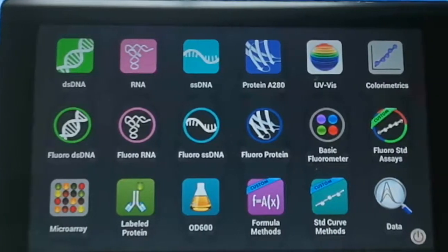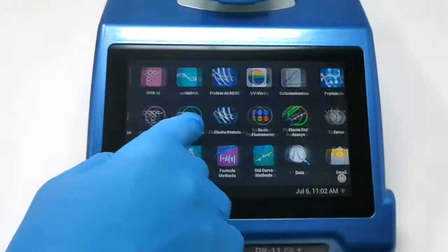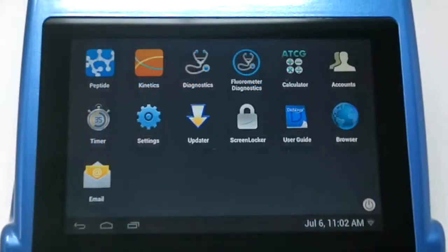And then we can swipe through to the second page, and here we have some additional measurement apps such as peptides and kinetics, but also some of the housekeeping functions for the DS-11 series. So things like diagnostics to check correct working of the instrument. We have that for UV vis and for fluorescence. And also here we set up things like user accounts, so they can be password protected user accounts for the instrument. And also we have a number of other functions like calculators and timers, and we can update software and set up our general settings from that page.